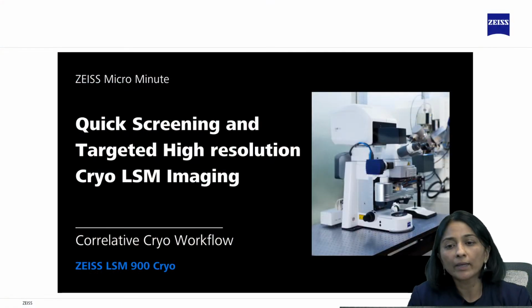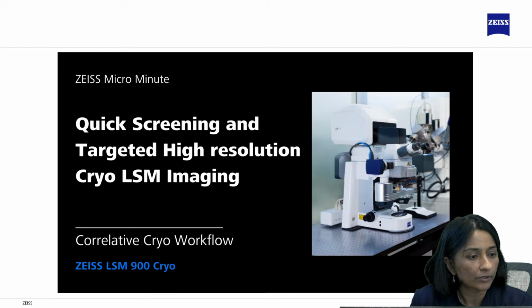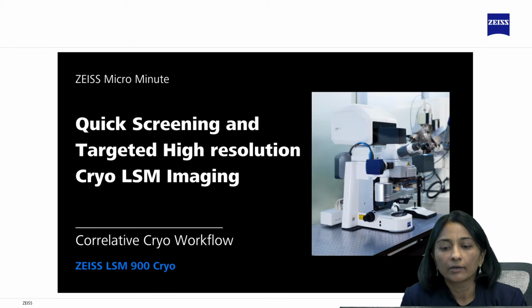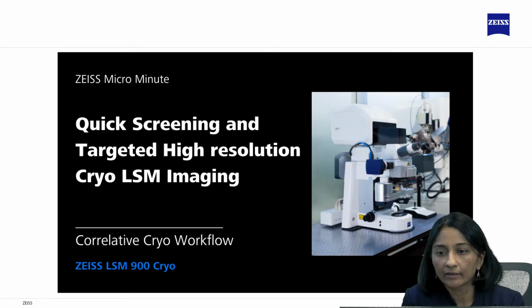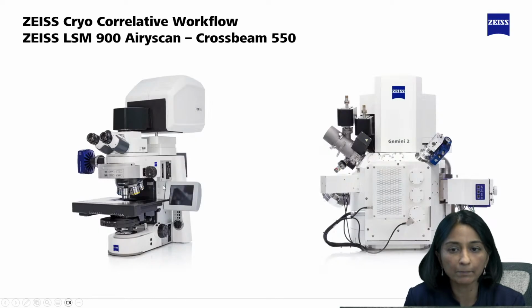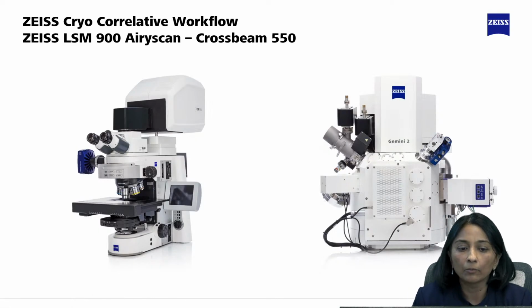So today, the topic that we are going to look at is quick screening and targeted high-resolution cryo LSM imaging. So let me go full screen and share. Yep. So the LSM 900 is part of our cryo correlative workflow. And what is a correlative workflow in the cryo realm?